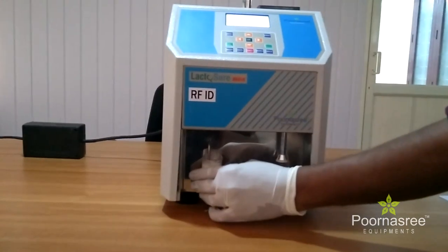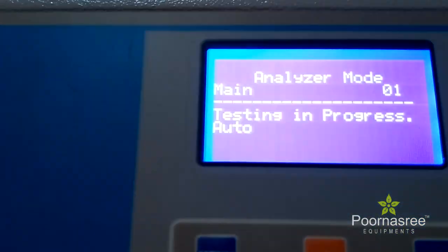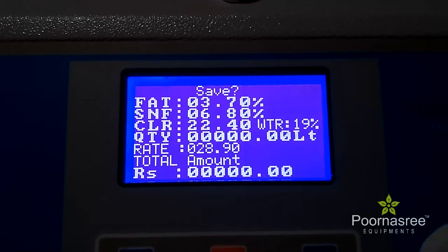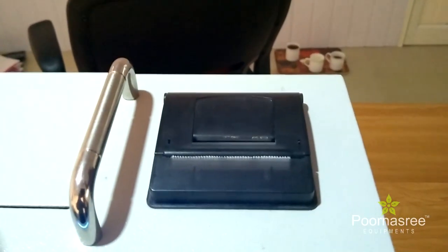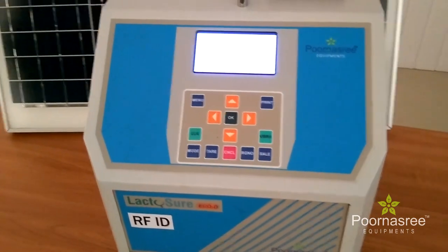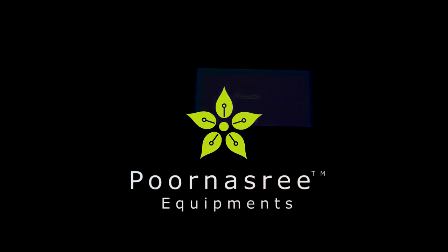Now take the milk into the analyzer for testing. Press the analyzer button. You can see that the milk is being sucked inside for the testing. The result is already available in 27 seconds. Now this result can be taken out from the printer. You can print the individual farmer's details, which can be given to the farmer as a receipt.